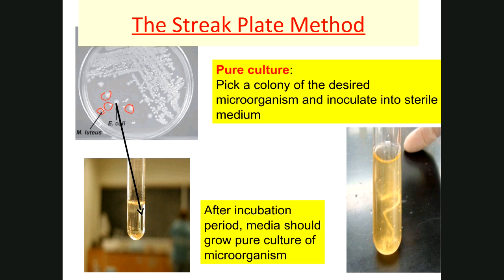So you know there are two organisms growing, and let's say you want to isolate the big one here, which happens to be E. coli, and grow it in a pure culture. Then, using aseptic techniques, and let's say this plate was obtained with the streak for isolation, which is what it looks like, and you can see the quadrants, you can take that E. coli, put it in a broth, and then you have a pure culture there. Okay, so that's essentially the idea behind streaking a plate for isolation.